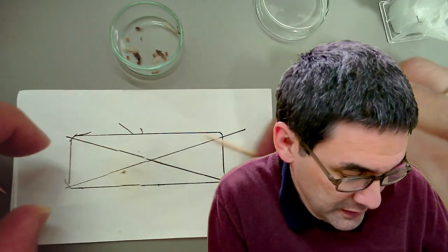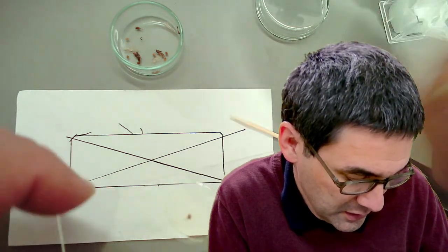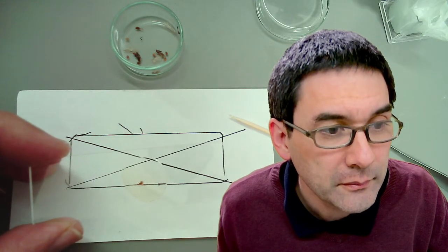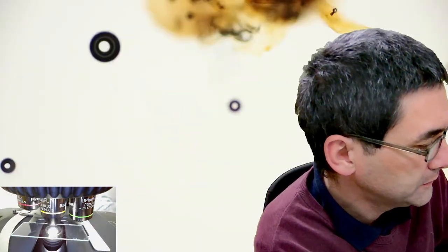So let's have a look at this here. Okay, I now got some mounting media here. So this might be the stinger. Again, I think it might be, but I don't know. We're going to see. And yes, this is the stinger.